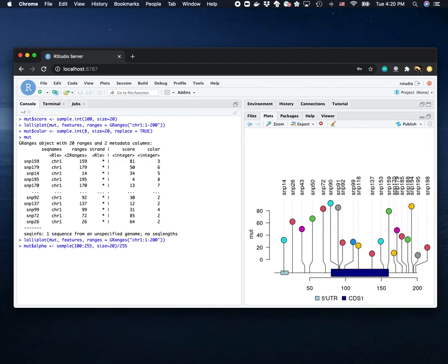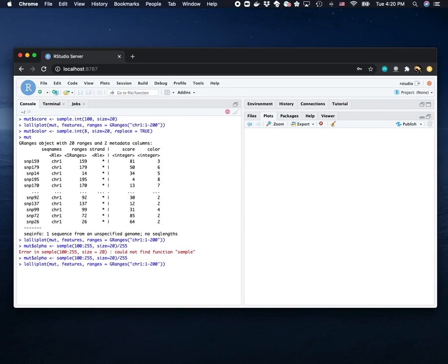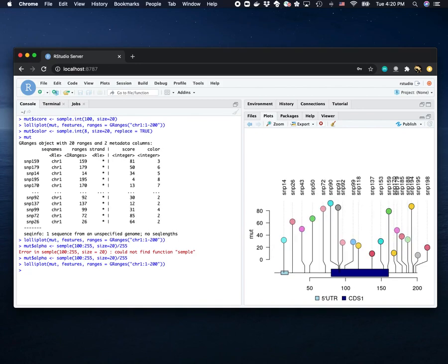Convert it. You can see alpha value is applied.